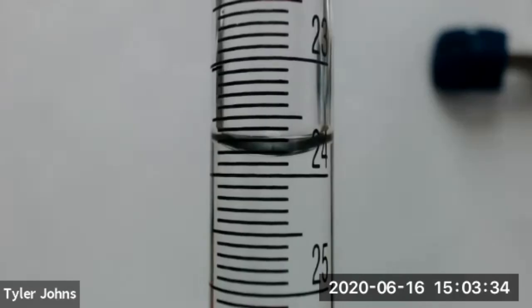This is the final volume reading on the burette for trial number 2. Note that the volume appears to be just over 23.8 milliliters, but you need to make sure that you record the correct number of significant figures on your data sheet. This concludes trial number 2.